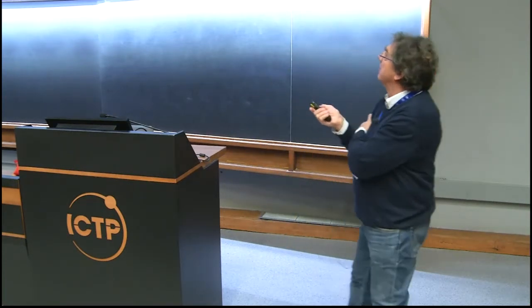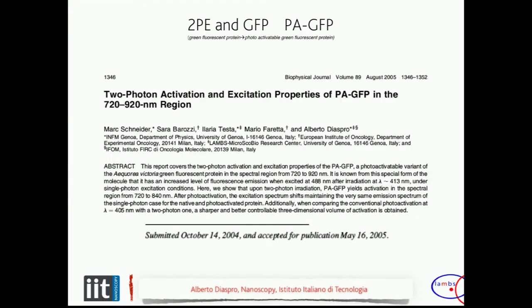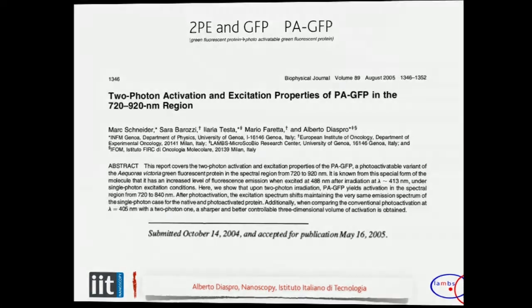Then you have, in 2005, following the paper by Jennifer Lippincott-Schwartz and George Patterson, we decided to apply the very same to this photoactivatable GFP.